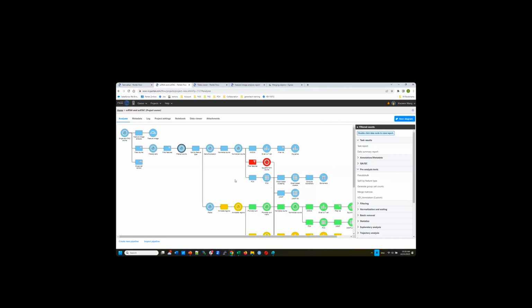Also, if you look for any biomarkers or any database, all the databases are based on gene expression. They will give you the name of the gene. They won't give you the location or the chromatin opening regions as a marker. So for that reason, I think you can use the gene expression data to do cell type classification. And the method is exactly the same. You can go to our single cell RNA-seq data analysis videos, those two videos, to look at the details.